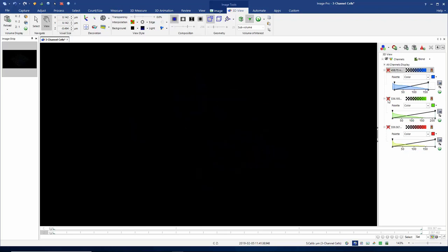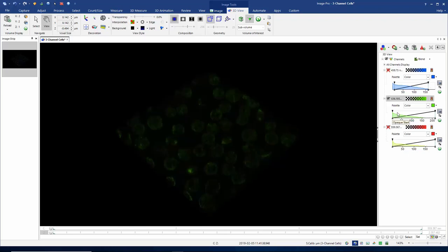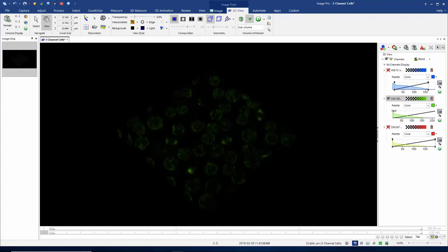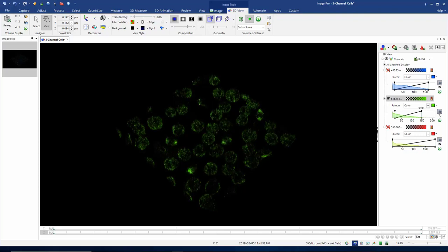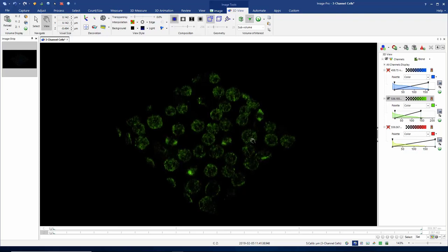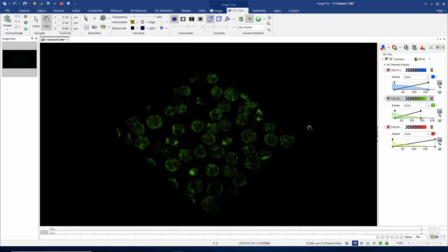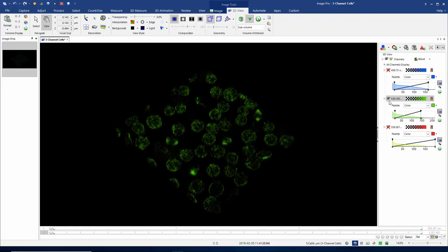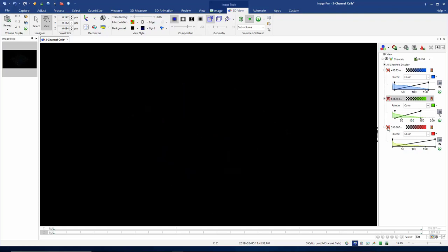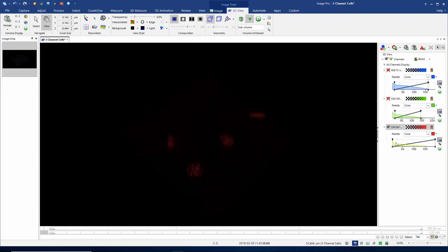I'm going to hide my blue channel, show my GFP channel, and again change the black point to make the background look dark and adjust the white point to make my objects look more contrasty. And we'll do the same thing for the red channel.